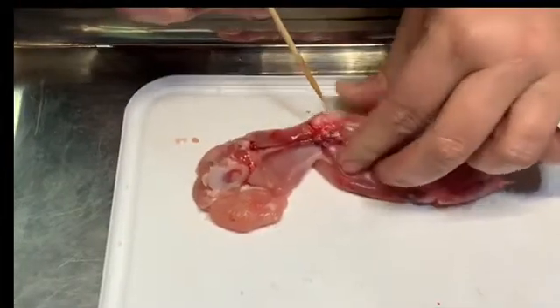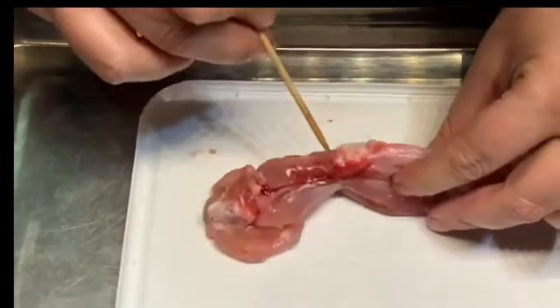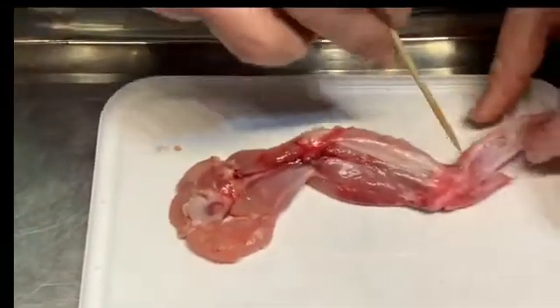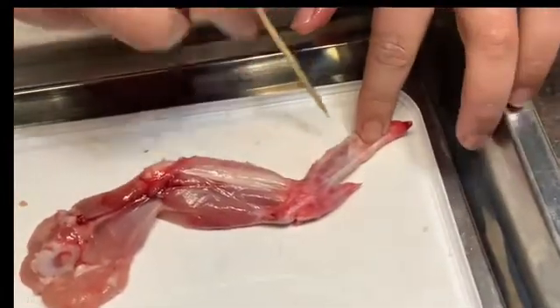This joint, that you can just make out underneath all this tissue, is the elbow joint. This obviously is the shoulder, the elbow, and the wrist, and in here would be your carpals, metacarpals and phalanges.